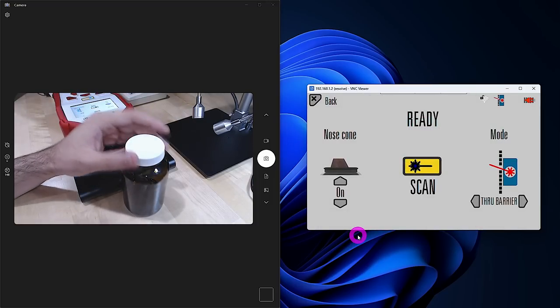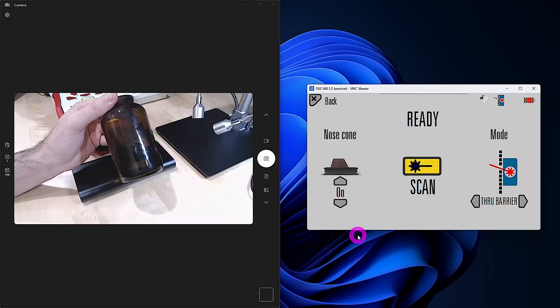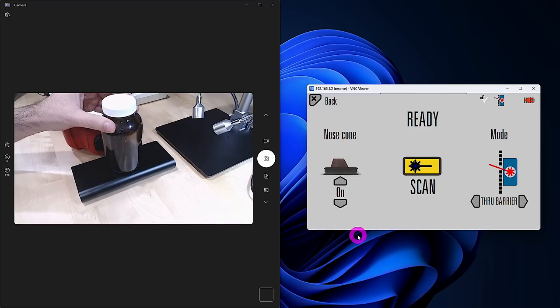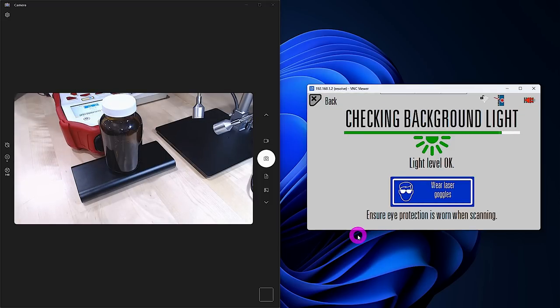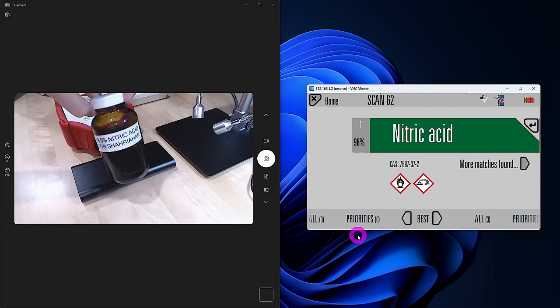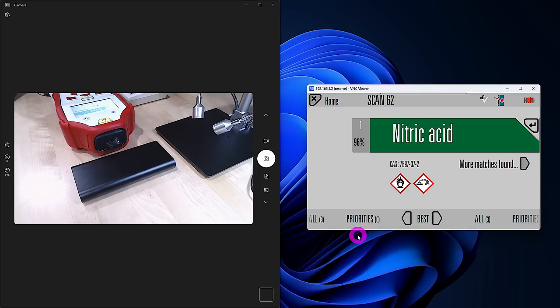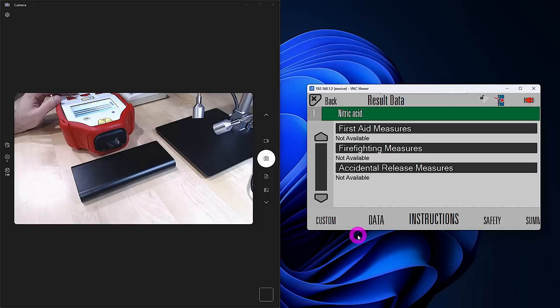Here's a really difficult example: a mystery liquid in a brown glass container. These containers are specifically designed to block out light, making Raman measurements very tough — you need very high sensitivity. We'll use a higher laser power for this one. Let's see if it succeeds. Look at that — 96% confidence that this is nitric acid, and it is nitric acid. Nitric acid is quite dangerous; fuming nitric acid can be quite harmful to your lungs if you're not in a fume hood. Here we can get more information about the material and instructions on how to handle it.